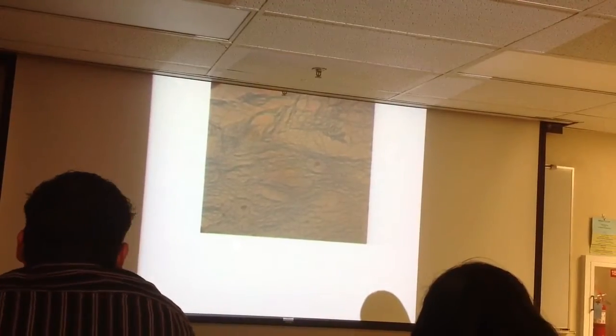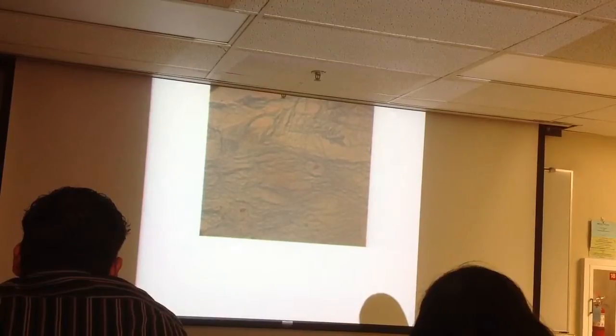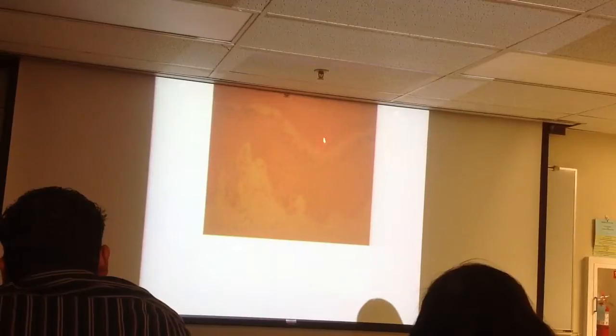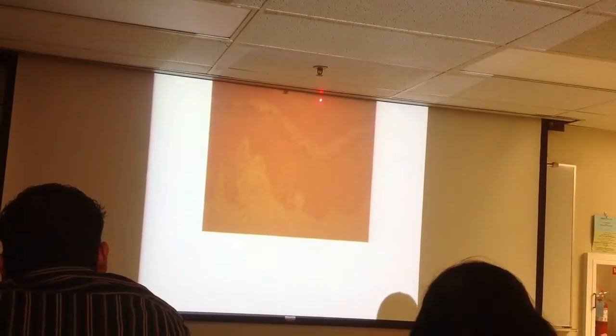Type of tissue. You can see nothing but fibers pretty much because it is fibrocartilage CT. Organ: vertebral disc. Okay, and now this one you can actually see the clear region. So all of this from here to here, that whole region, is epidermis.